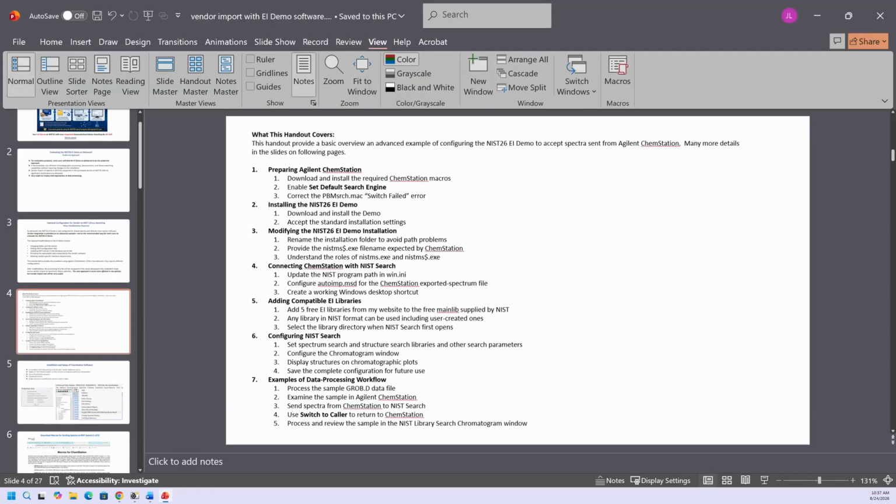In most of my videos with associated handouts, the video really stresses the majority of the important information, but due to this topic, you'll have to use the handout to carry you through step by step how to make the necessary modifications. I've listed it somewhat in an outline form here, so I will not cover this outline, nor will I cover the slides. You'll have to look at it later, but I will go through and show you some of what I think are the key ways to modify things and then give you a demo of the software to compare both the vendor import of the Spectra versus direct processing using the chromatogram.